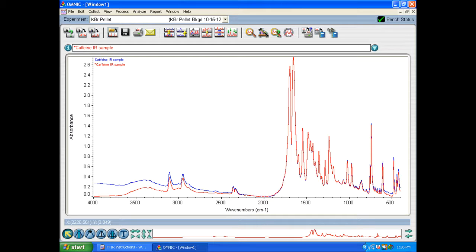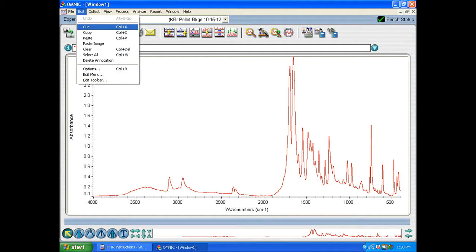So next what we'll need to do is change it from absorbance. You can see on the y-axis it says absorbance and we want to change that to percent transmittance. So before we do that though let's go ahead and get rid of this other sample spectra. So go ahead and just click on that blue looking one and now you'll be on that and that blue looking spectra is now red and the other one is now green. Go up at the top to edit and cut to get rid of the old spectra the one that hadn't had its baseline corrected.